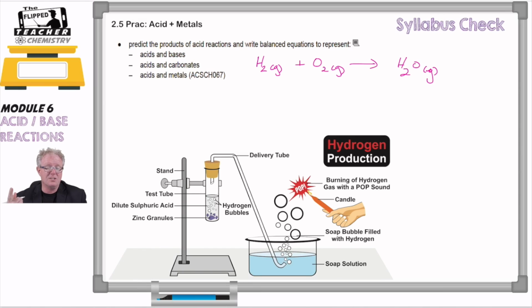and I'll put gas there because it's in the gaseous state, it's so excited rather than liquid, but I guess you could argue that vapor, liquid vapor is gas anyway. But that was energetic. In other words, an exothermic reaction, and that sudden release of energy causes the air to expand suddenly, and that's why you hear the sound, right? So in explosions, the sound you hear is from the air suddenly expanding.